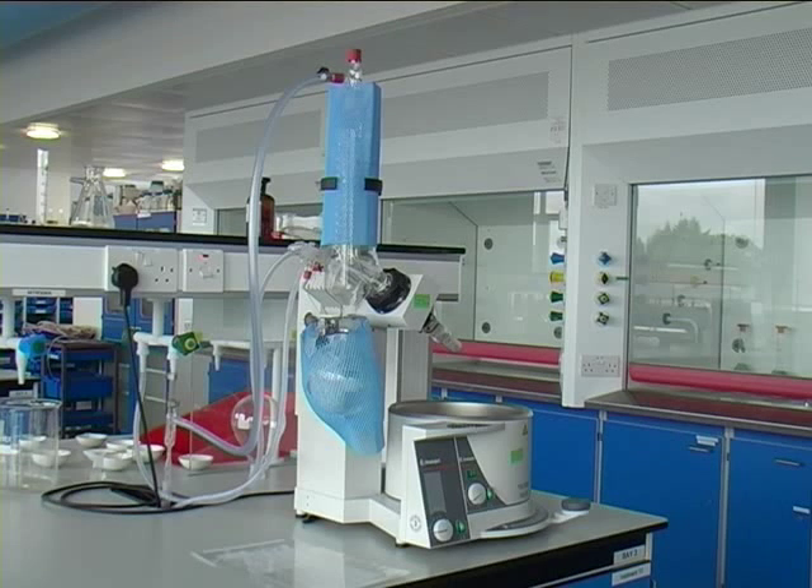Rotary evaporators are used for the efficient removal of solvents from samples by evaporation. The boiling point of the solvent is lowered by applying a vacuum. The temperature of the water in the bath is kept at about 30 degrees C below the boiling point of the solvent being evaporated.